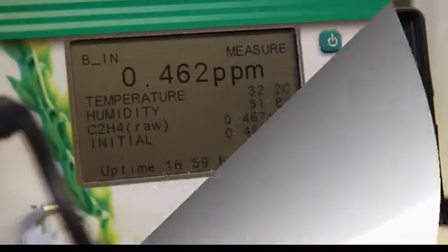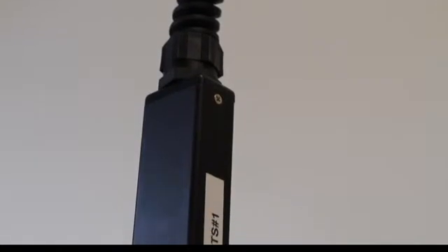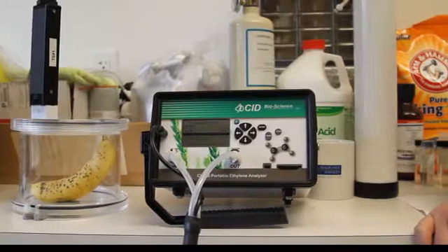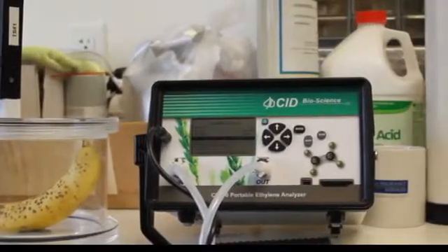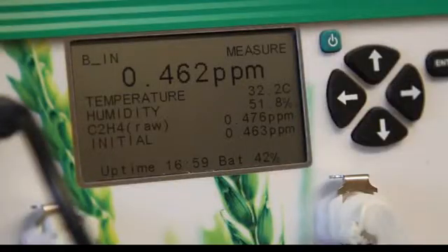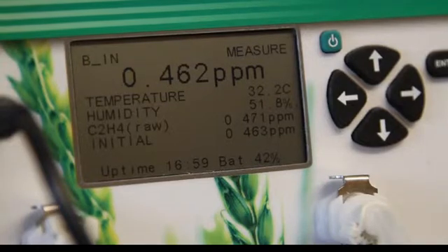Now we are once again in the measurement phase. As we set before, the CI900 will go through 4 minutes of measurement, and then switch over to a cleaning phase, and measure once again. After the cleaning phase, we are left with our real-time measurement of the ethylene gas composition of our banana sample.